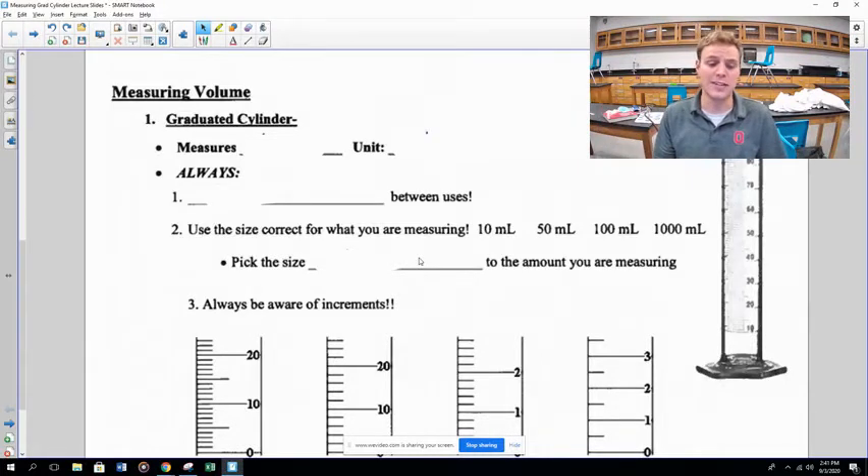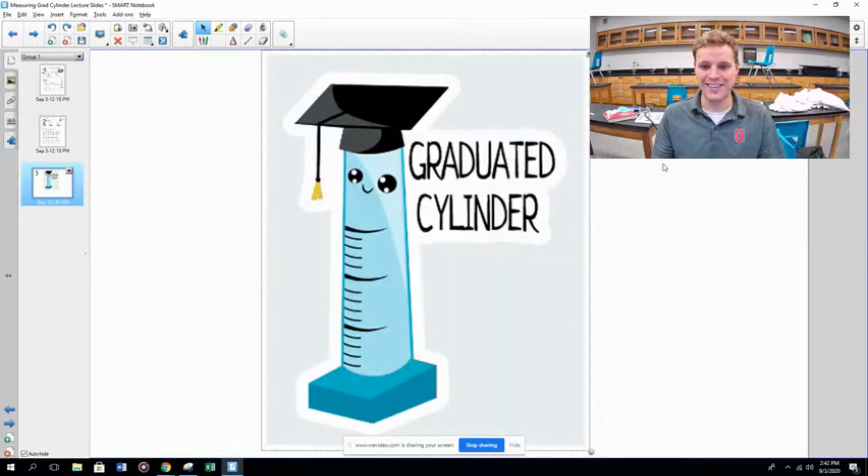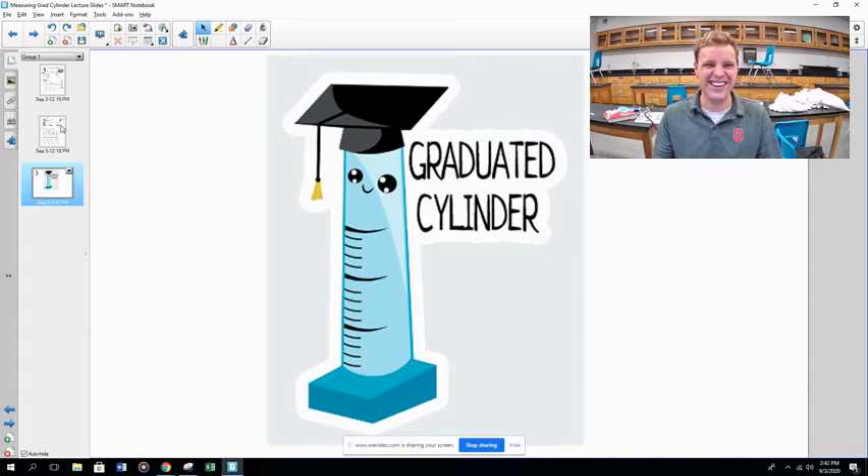Now we need to talk about how to measure volume using a graduated cylinder. But first — the most important part of this video — a dad joke: look at this little graduated cylinder with his little graduation hat and tassel. About 87% of you are disappointed; 13% think that joke is fire. Anyway, let's talk about how to actually use a graduated cylinder.